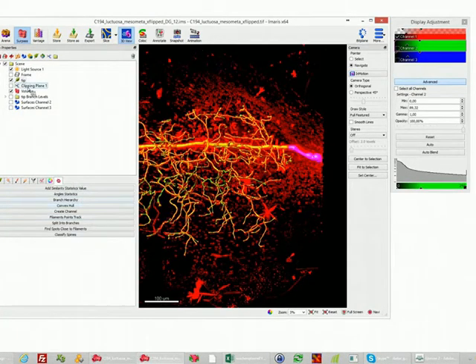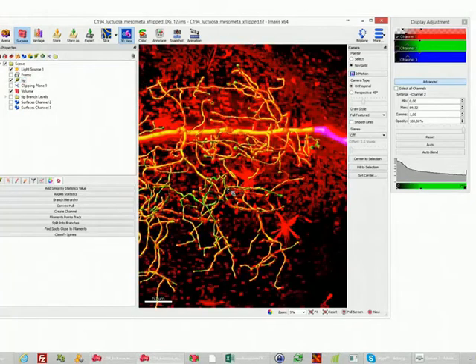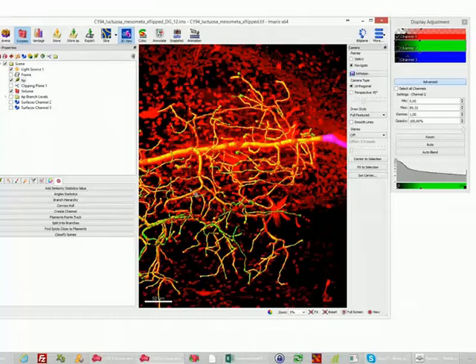If I select this and press branch hierarchy, the software would recalculate the connections. It will send the topology and all the diameter information to Matlab, and in Matlab the tree structure would be recalculated and resorted so that we get continuous side branches sorted by level. At the moment, if I click on this, you see it's little segments, and what we need for the count is the complete second level as one branch.